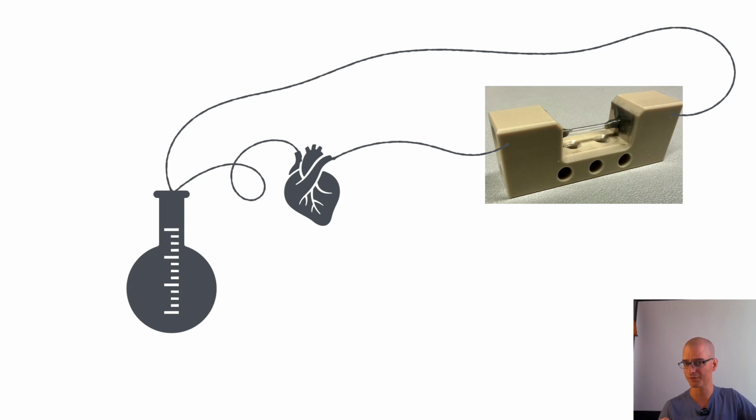And this is actually the best way of doing in situ experiments, as opposed to trying to do reactions in your capillary. If you try to do reactions in your capillary itself without actually moving the liquid, the kinetics could be very far off from the normal lab scale reactions that you do. So try and do things on the lab scale and then pump a little bit of the reaction liquid through if you can. Much more consistent results, much lower chance of actually affecting the kinetics with your X-ray beam.